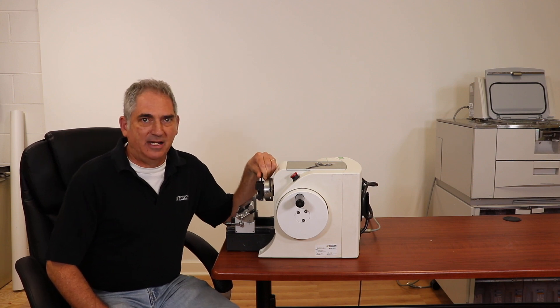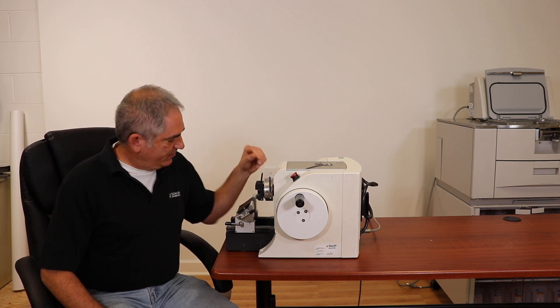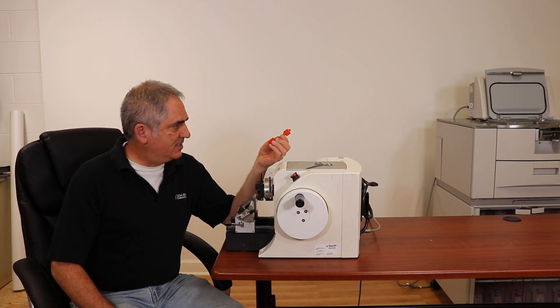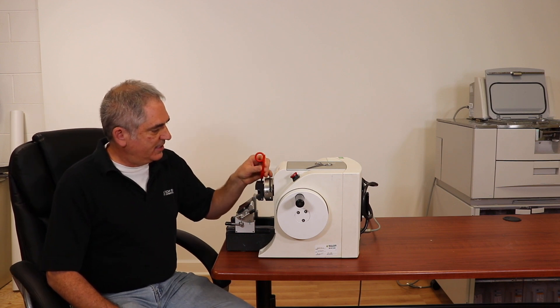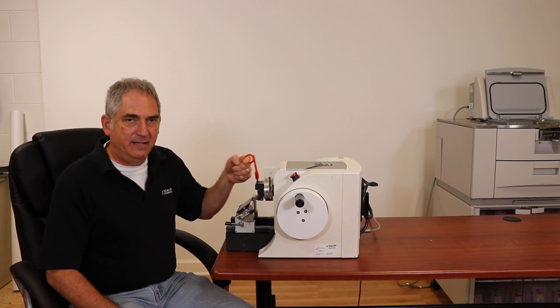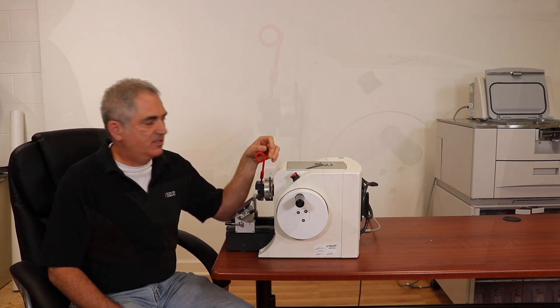I thought, well that's kind of an interesting idea, and I mulled it over for several months. I kind of regret the fact that I didn't start it earlier, but I started working with CAD and I came up with this. This is a rough prototype of the extension — it just slips right onto your Microtome cassette clamp and you can either use it like a regular cassette clamp lever or you can put your finger in the loop. It just takes a lot of the stress and strain off when you're adding and removing cassettes.